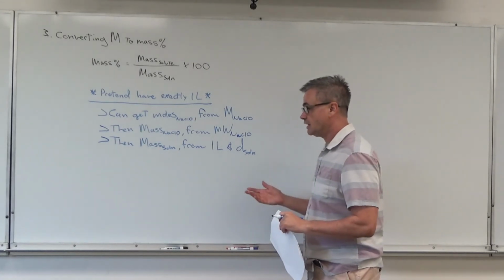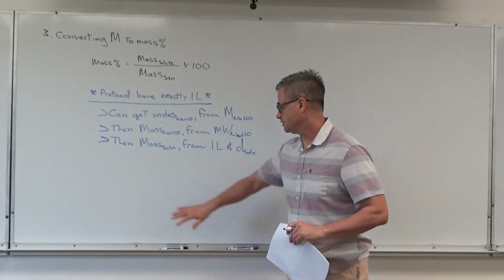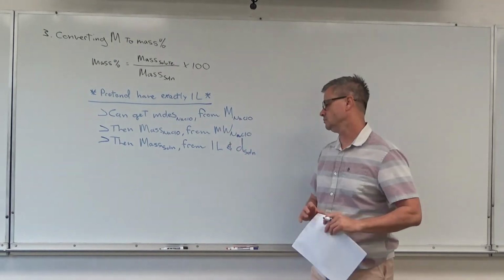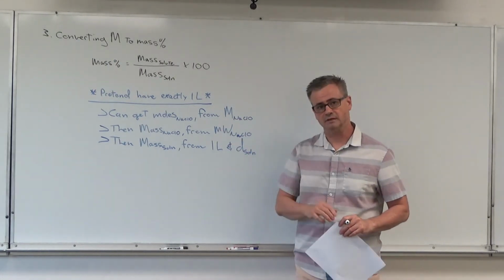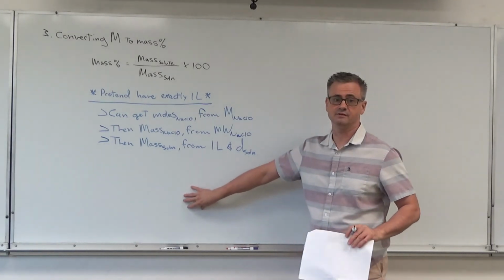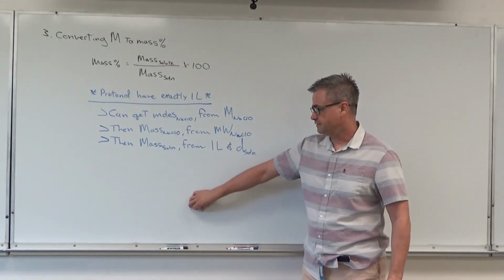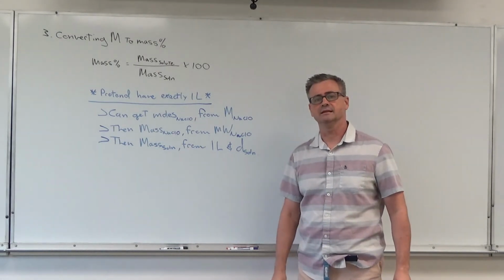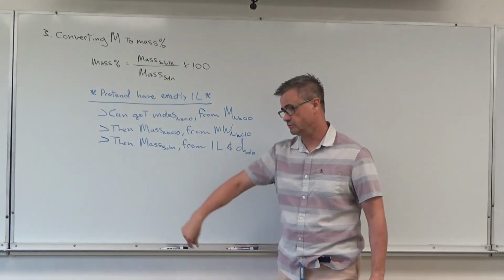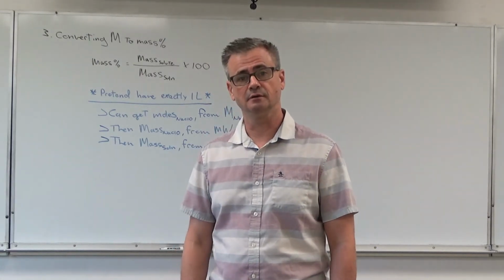There are a number of different trials. You're going to have to calculate an average. You're going to have to create a standard deviation for your average, and you all know how to calculate a standard deviation. If you don't, that's an easy look up. And then you're going to have to calculate a relative standard deviation. The worksheet walks you through how to do that. It's basically the standard deviation over the average. That's it, guys. Have fun.